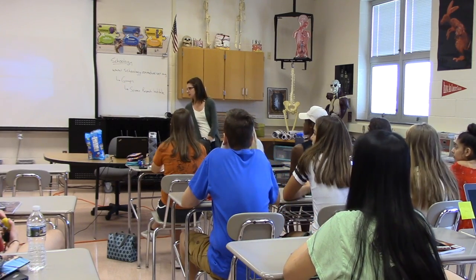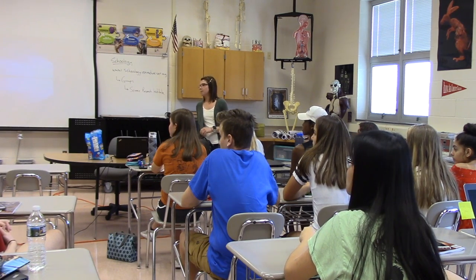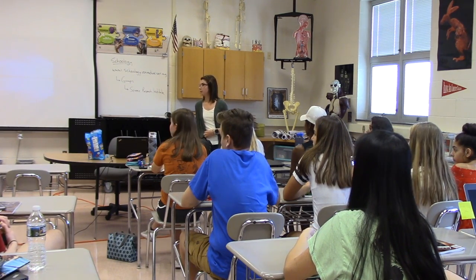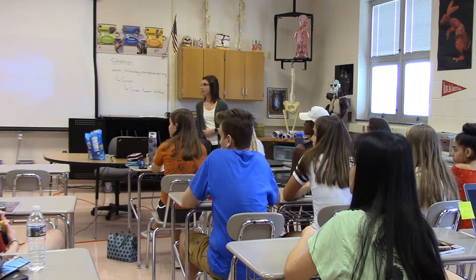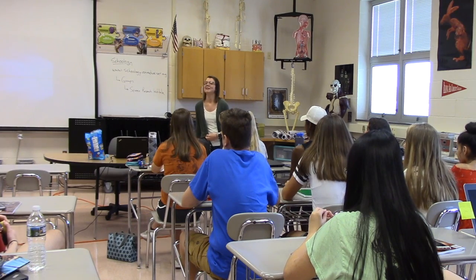Do you guys use aseptic technique? Do you guys work in a BSC? Yeah, we have a biosafety cabinet. Okay. We have a little tour to give her. We got 2 biosafety level 2 cabinets now. That's awesome. Yeah, that is so cool.